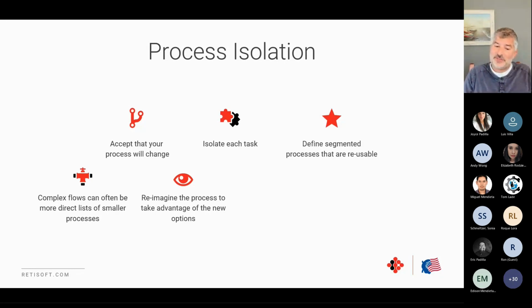But you also have to remember things are not infinitely flexible. You're trying to create standard and simple processes or tasks, combinations of simple tasks, not give the user thousands of options or choices at every task, because then it would be no longer simple or consistent, and people like to turn knobs, and that will then ultimately not give you consistent data in the end, and there'll be too many variables you need to look at just to know what is this information.